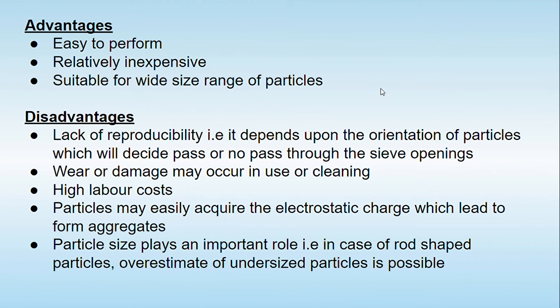Now let's try to understand some of the advantages. The sieving method is the oldest method, is easy to perform, relatively inexpensive, and is suitable for a wider size range of particles. But some problems are associated with this technique, that is, the lack of reproducibility.